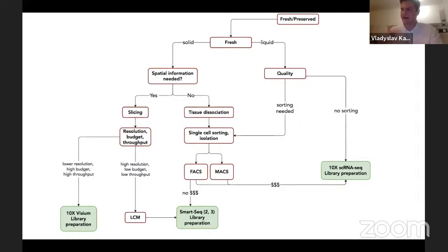The time that you are lasering your tissue is not enough to affect the quality of your RNA if you are doing it quick. So, does laser capture microdissection kill the cells? What power and wavelength do you need to use to not damage the cells? Basically, the edge that you are cutting out is killing the cells, but everything that we need is in the middle, so that's why it will be preserved by the cutting out.